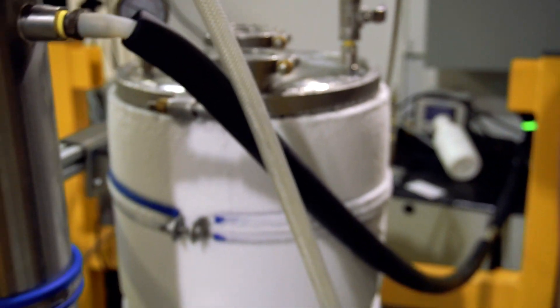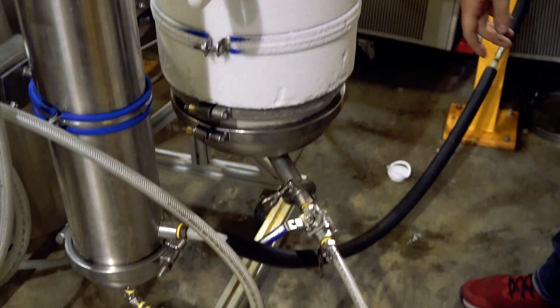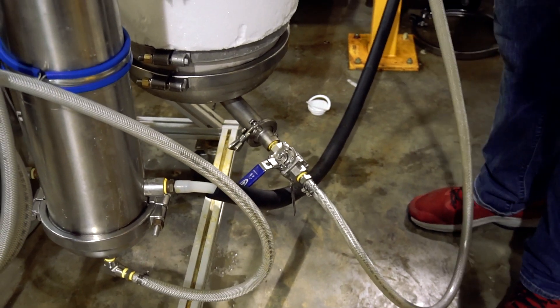Now that we have our filter pressurized, I'm going to open up this drain valve and we're going to see the material start to go through this hose into the top of our shotgun condenser.